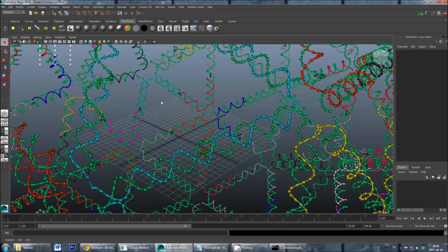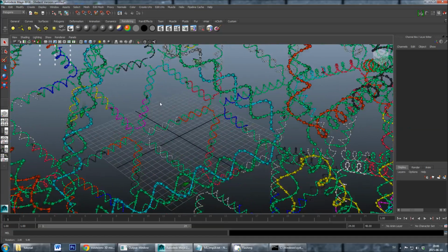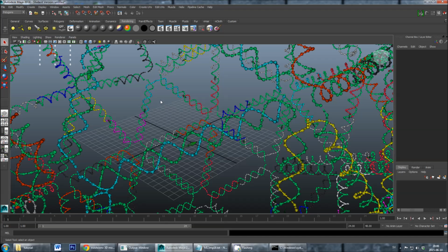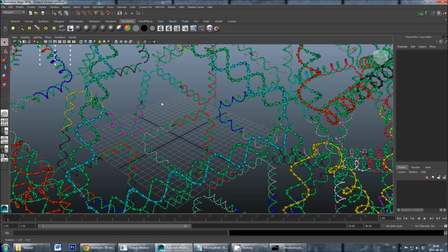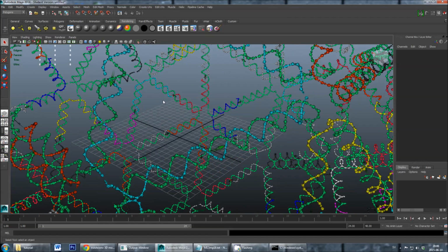And please note that the import process may stop a bit at 99%, but this is just normal. Now, if this import is taking more than a few minutes, this may be due to you selecting too large a scaling value in the scaffold routing and physical relaxation, and thus creating too large a structure. And if this is not what you want, you might consider redoing the scaffold routing and physical relaxation with a smaller scaling value.